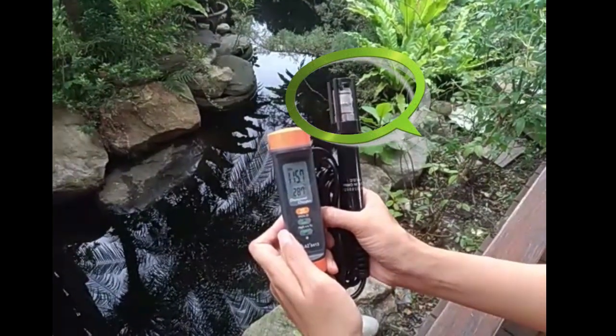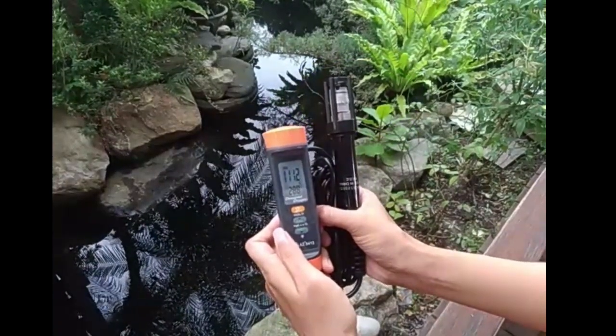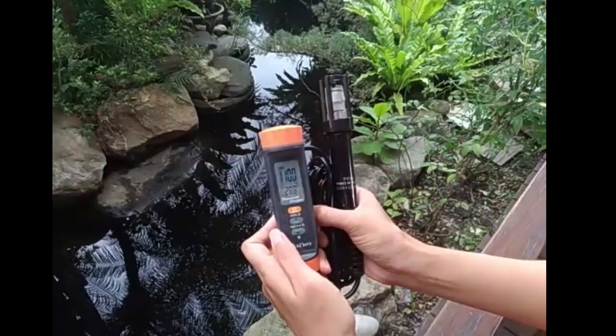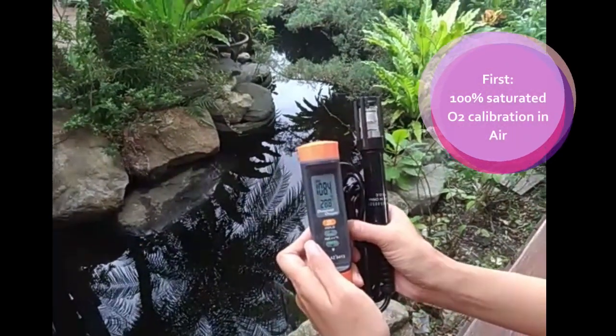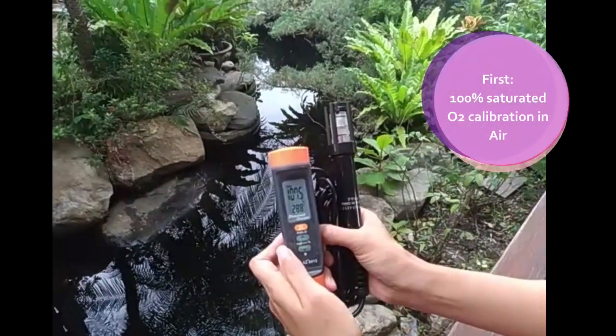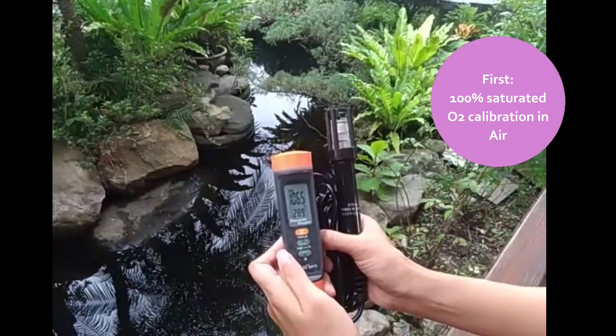The anti-collision cap has a protective function and there is no need to remove it before use. Before each measurement, put the probe in the air to do 100% calibration to improve the measurement accuracy. The calibration at this time can make the automatic temperature compensation effect best.